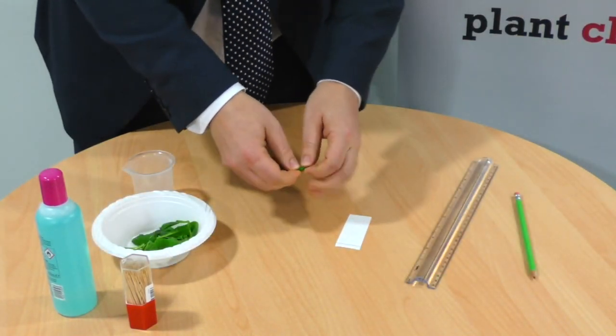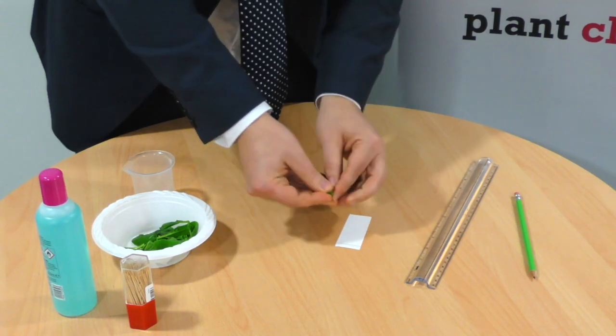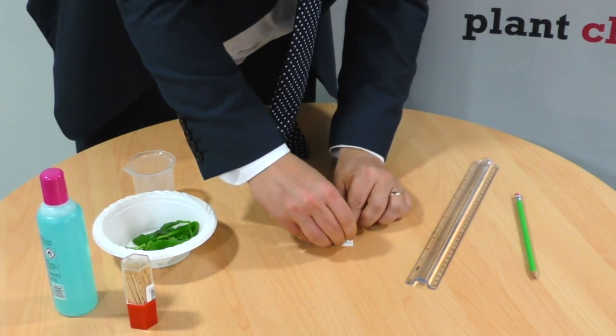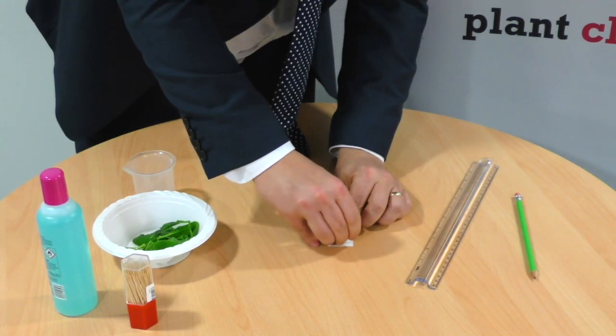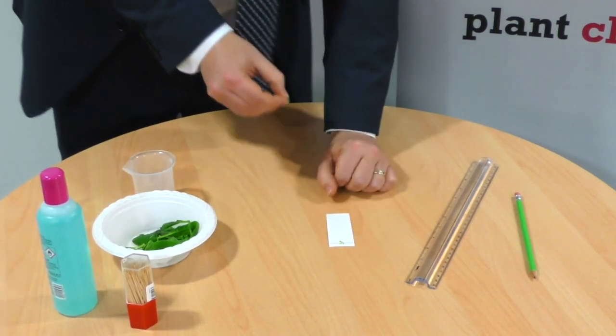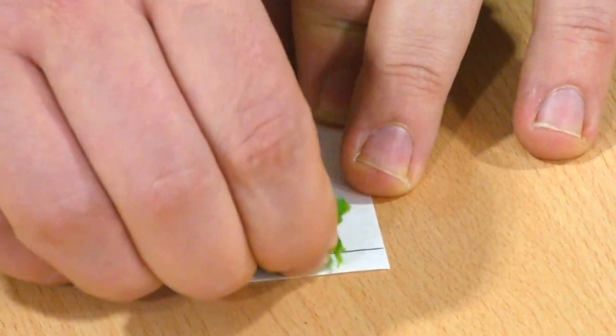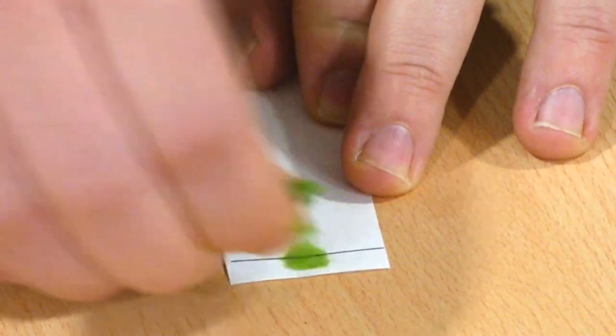Bundle up your leaf, roll it nice and tight, then rub it hard against the line that you've drawn and you'll notice some of the pigment from inside the leaf will be left behind. Continue doing that to build up as many layers as you can and get plenty of pigment on that line.